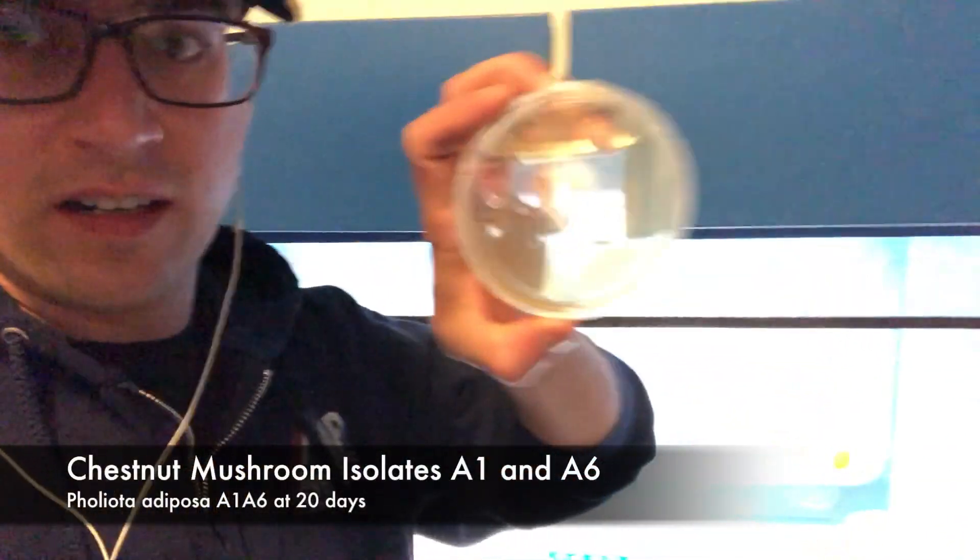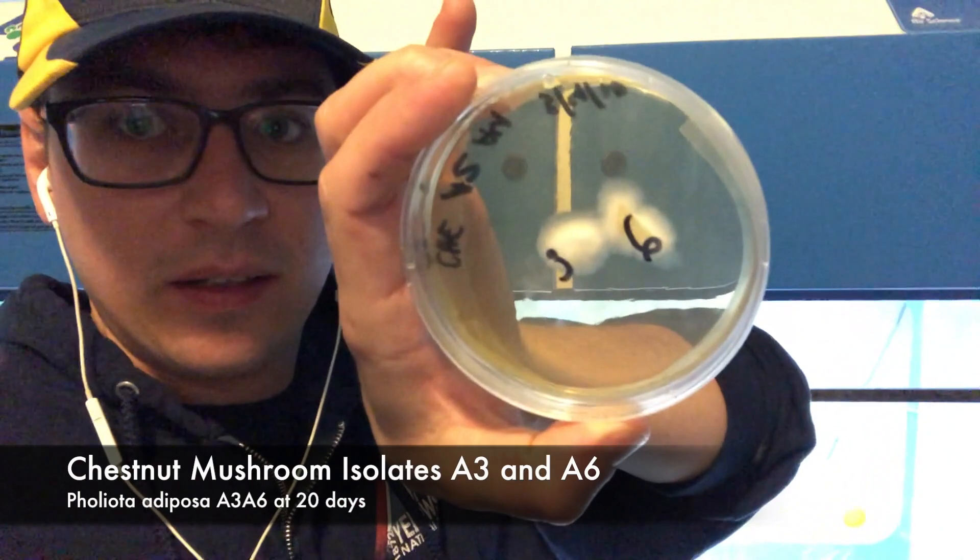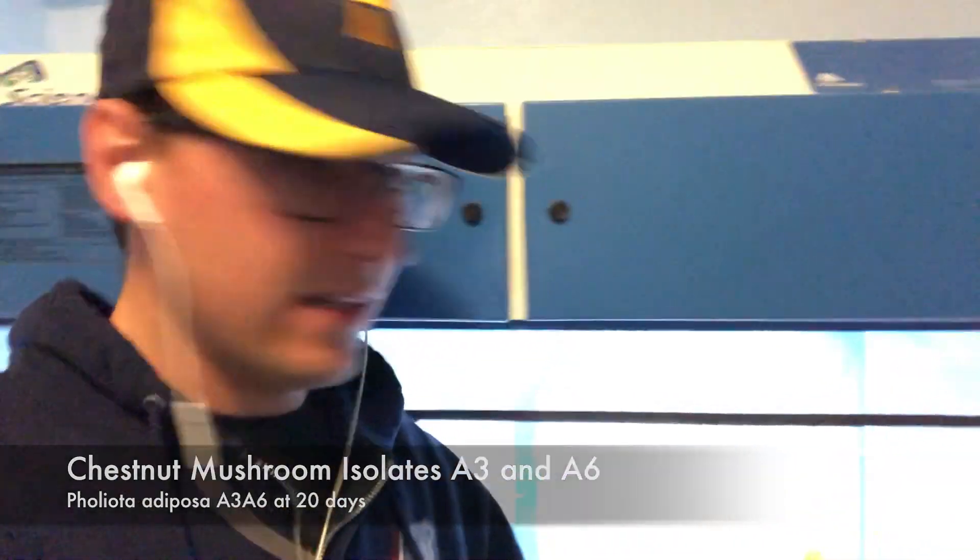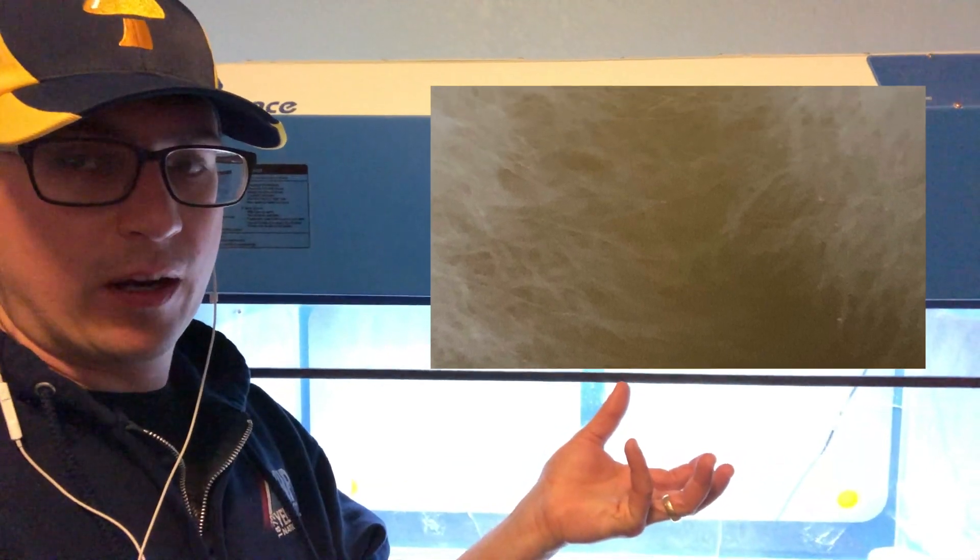So we finally got some crosses that are meeting with each other. That's pretty exciting. There's a couple of them and ideally these two colonies should merge together and form clamp connections, and then they will create compatible haploid to diploid mycelium. If they're not compatible they'll kind of segment away from each other and those plates are never going to produce any mushrooms.